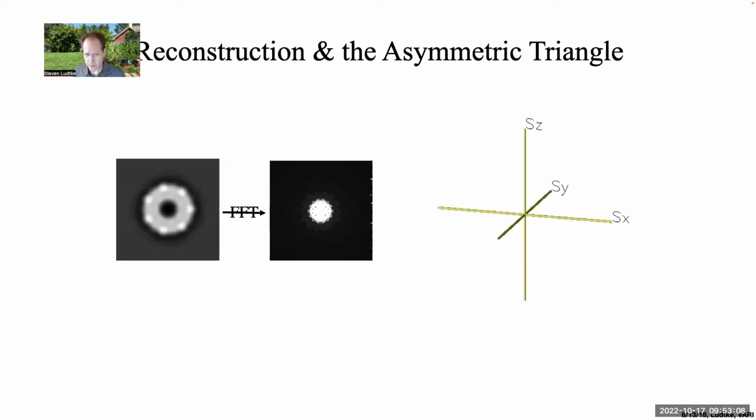I'm going to assume that everyone here knows a little bit about Fourier transforms, because that's another hour-long lecture, which I don't want to give today. If you don't know anything about Fourier transforms at all, I would suggest watching some YouTube videos, like some of Grant Sanderson's videos maybe, or just look up videos on Fourier transforms and try and learn a little bit about them. The goal isn't to become a mathematician or understand them at a mathematical level necessarily, but to at least have a general idea of what Fourier transforms are and represent.